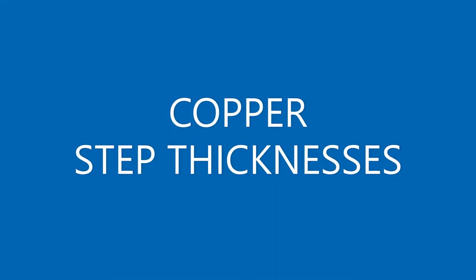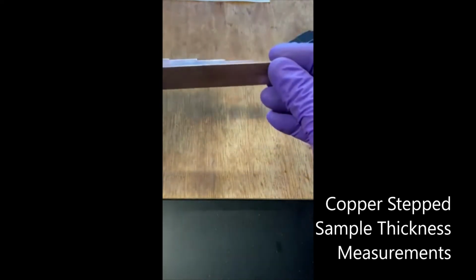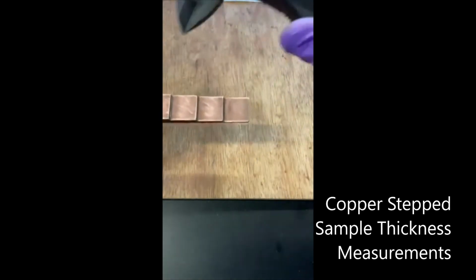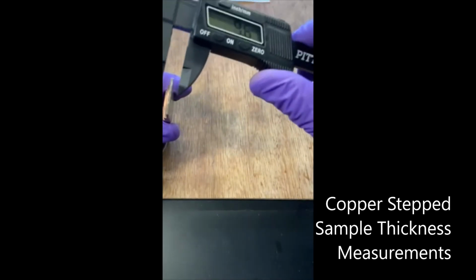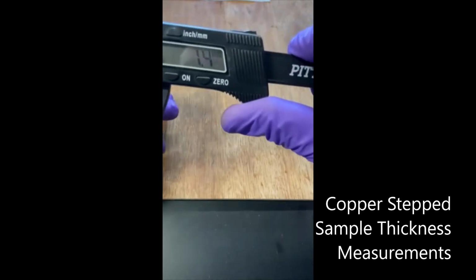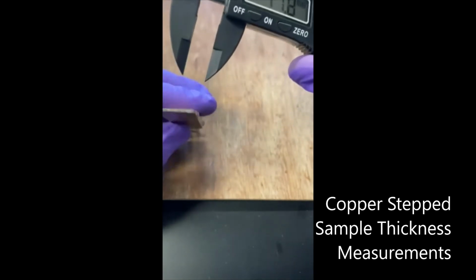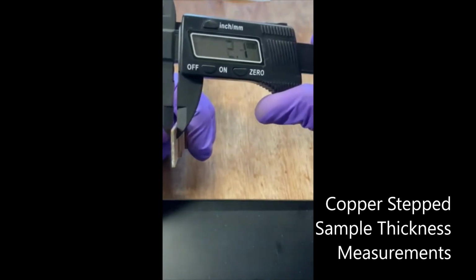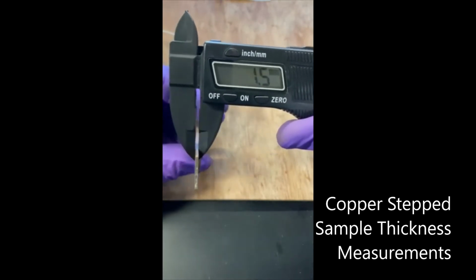Now we will demonstrate the measurement of one of the stepped metal samples, measuring the individual step thicknesses. Again, this process is repeated for each of the other metal step samples included at the end of this video. Once again, we will demonstrate this for the copper step sample. The step sample contains 5 steps.